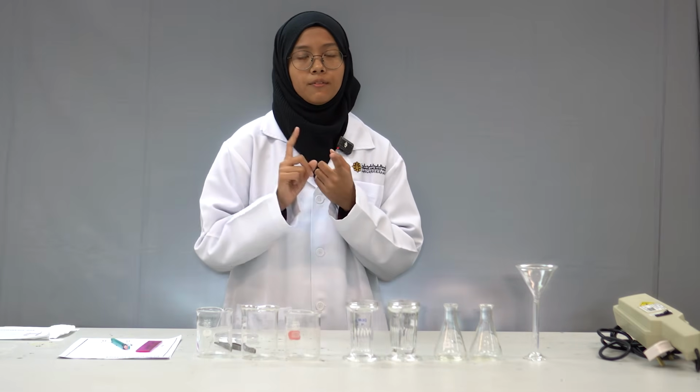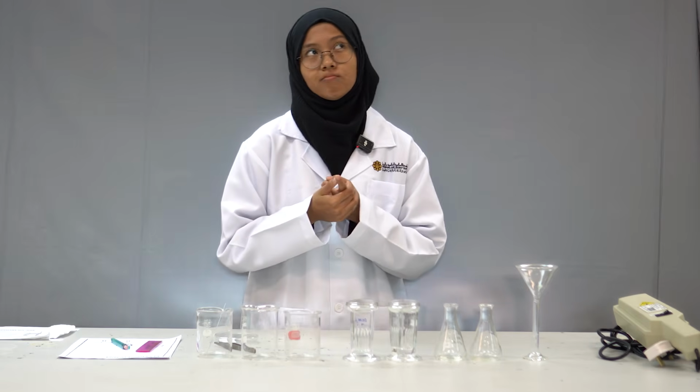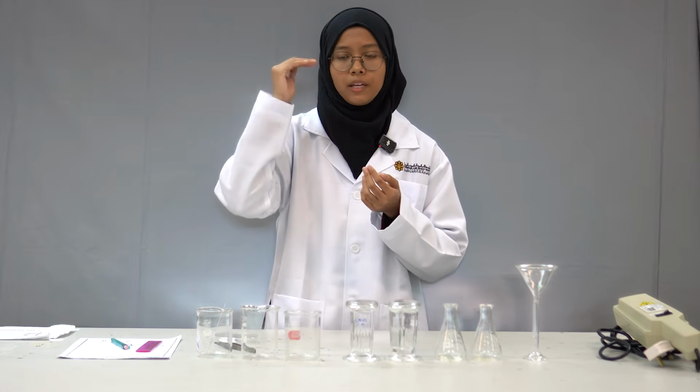The first is the stationary phase, and the second is the mobile phase. The stationary phase in this experiment is a silica gel TLC plate, which is a polar plate, and the mobile phase is our developing solvent, which will move further up the plate.